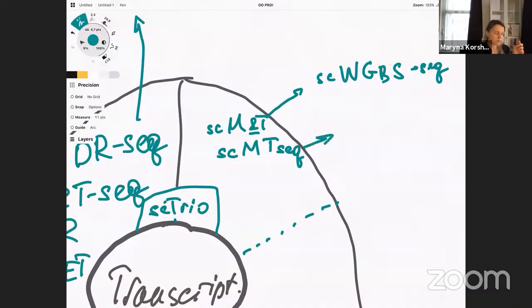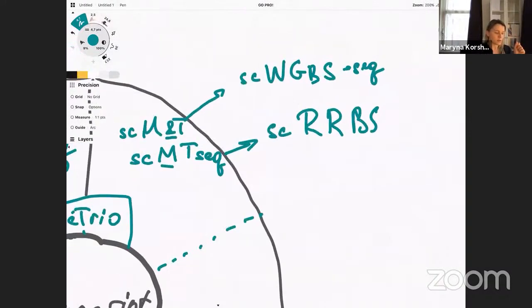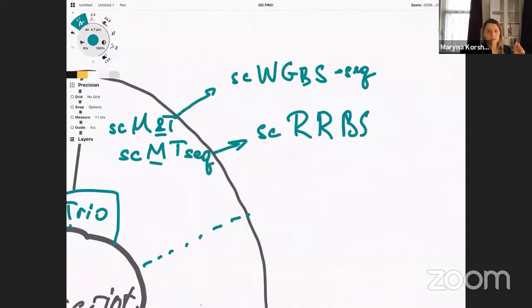and here is different, for RRBS, yeah, RRBS, I'm really sorry. Sequencing for tracking the methylome and transcriptome using regular single cell RNA-seq. So what is single cell RRBS? It's a single cell reduced representation bisulfite sequencing. So it's one modification of bisulfite sequencing for single cell data.